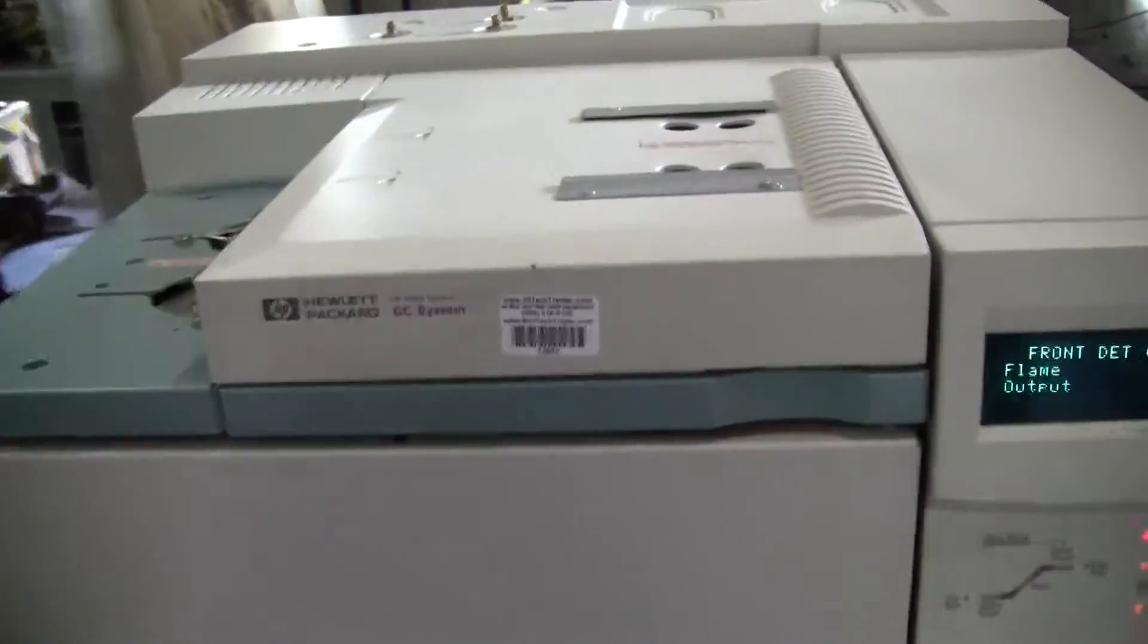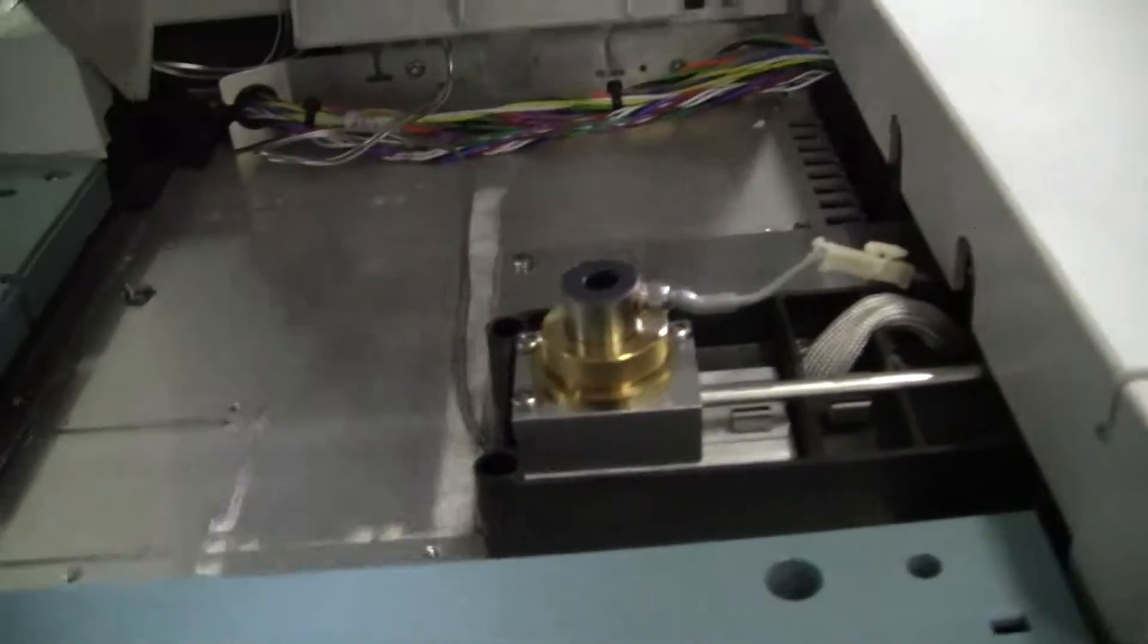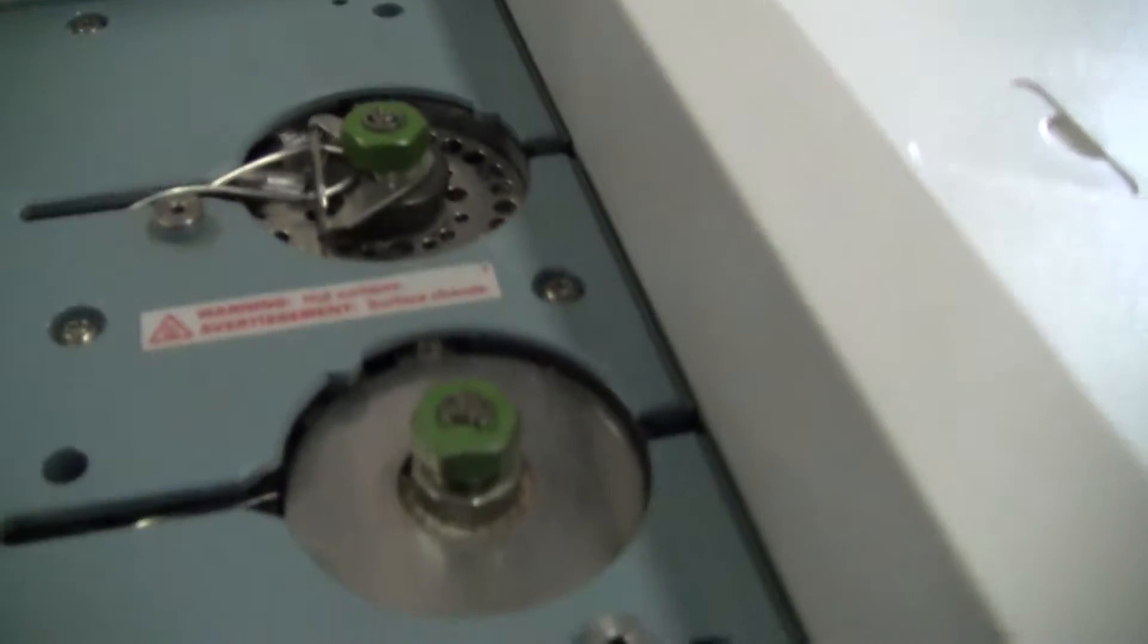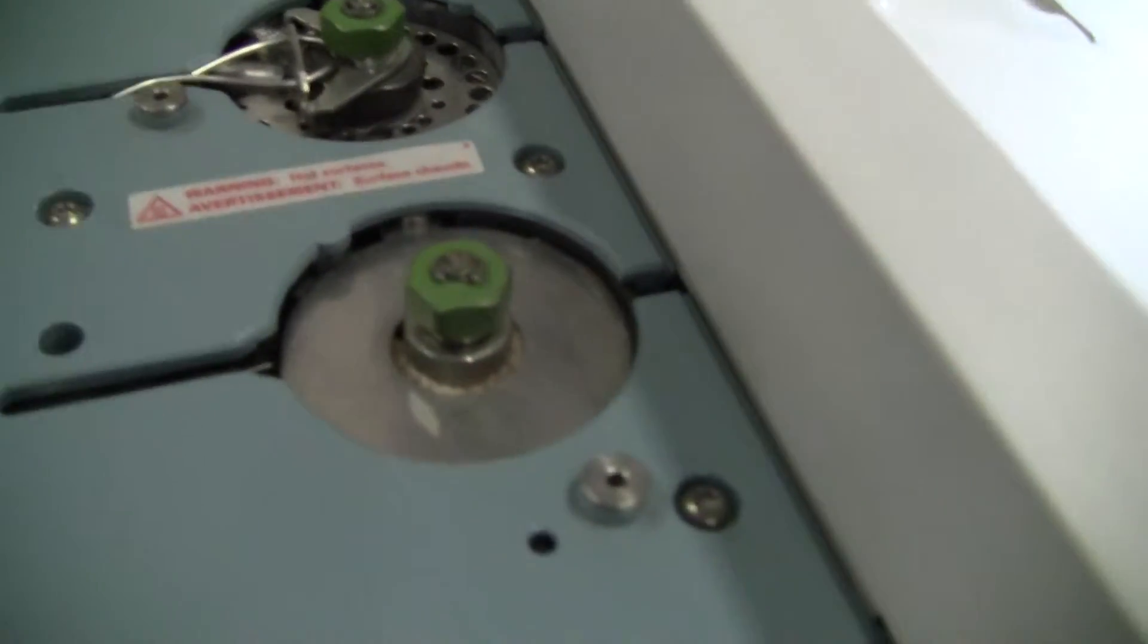This particular GC is set up to be FID, splitless, and a pack port.